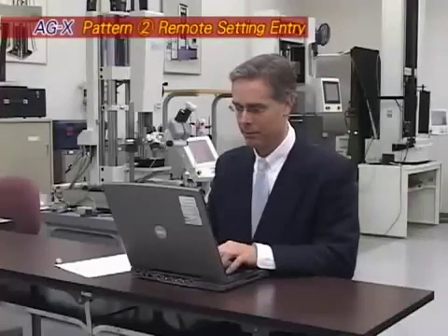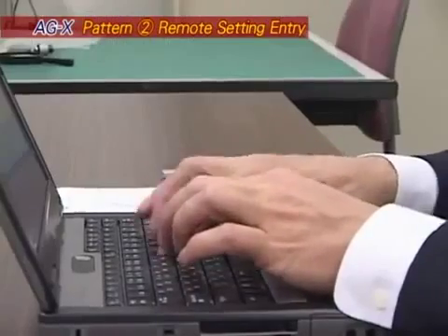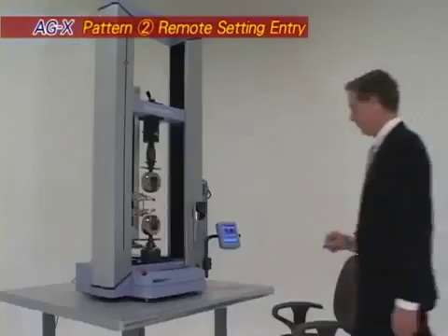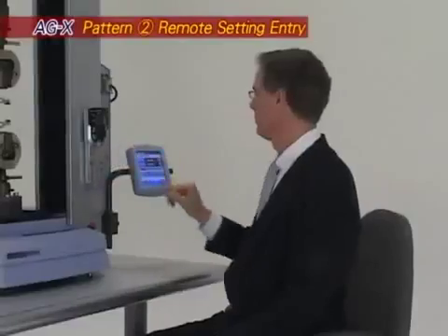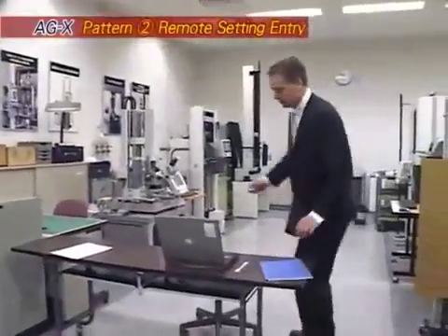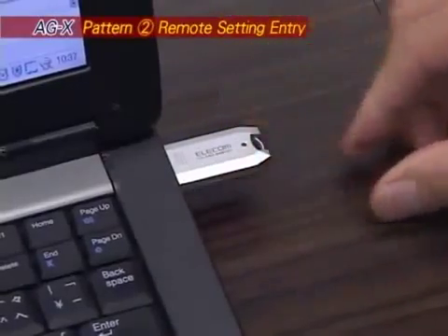Another major benefit is the portability of setting data. Parameters can be set up on a remote computer separate from the testing machine, saved to a USB memory device, and then quickly loaded into the machine to perform measurement using those parameters. After completing a test, results can be saved again to a USB memory device, then analyzed and processed into a report on a computer at a separate location.